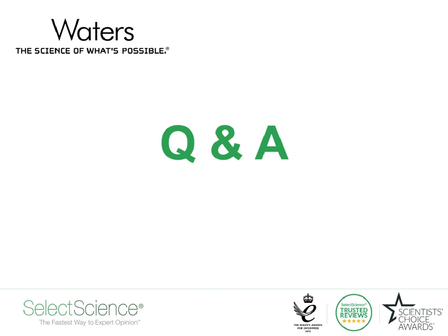Yeah, so I think that's a great question. In a previous lifetime, I used to work a lot in more things like imaging velocimetry and building light sheets and things like this. I think there are a number of correlation issues in combining those strategies, but depending on the question you're asking or the instrumental approach, you might be able to do that in some good applications. I don't know if, Malcolm, you would like to contribute to that.